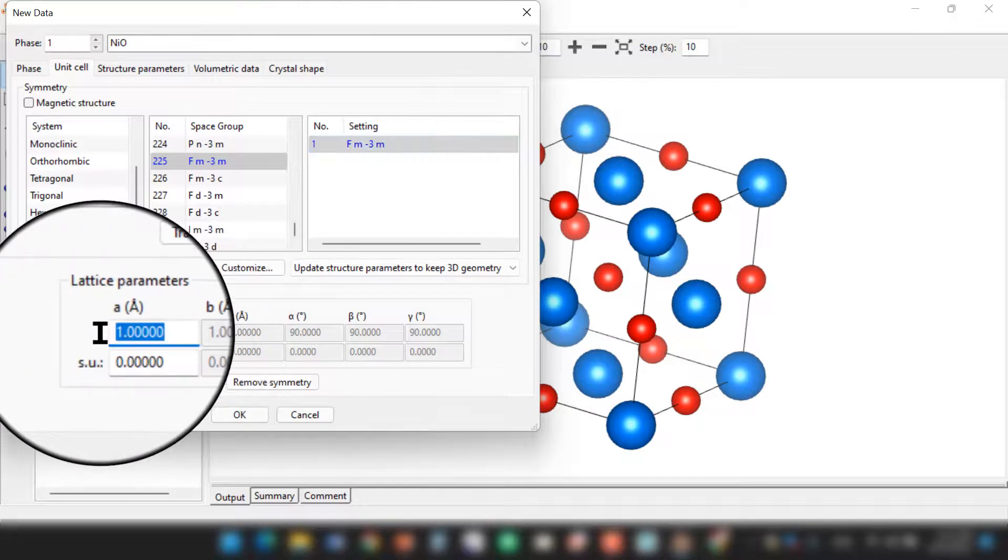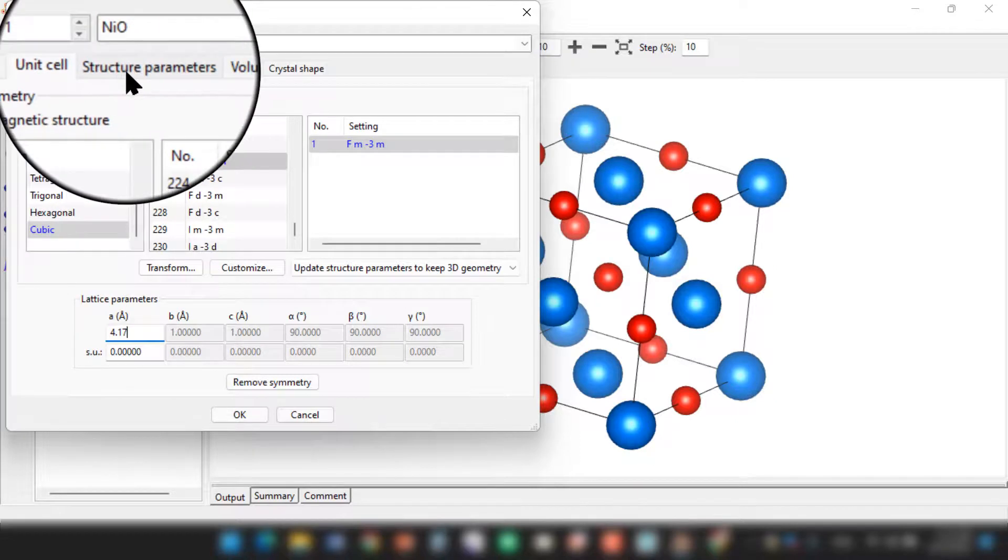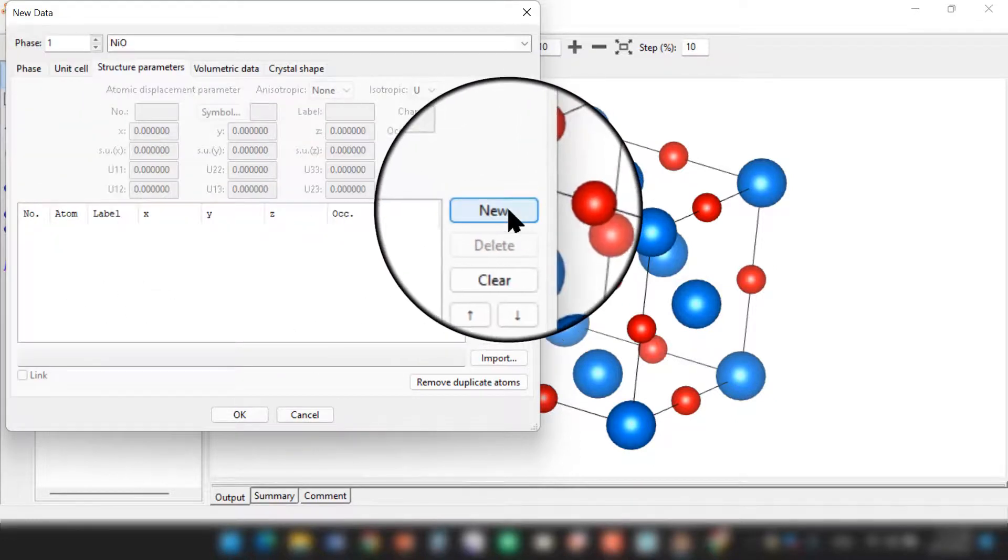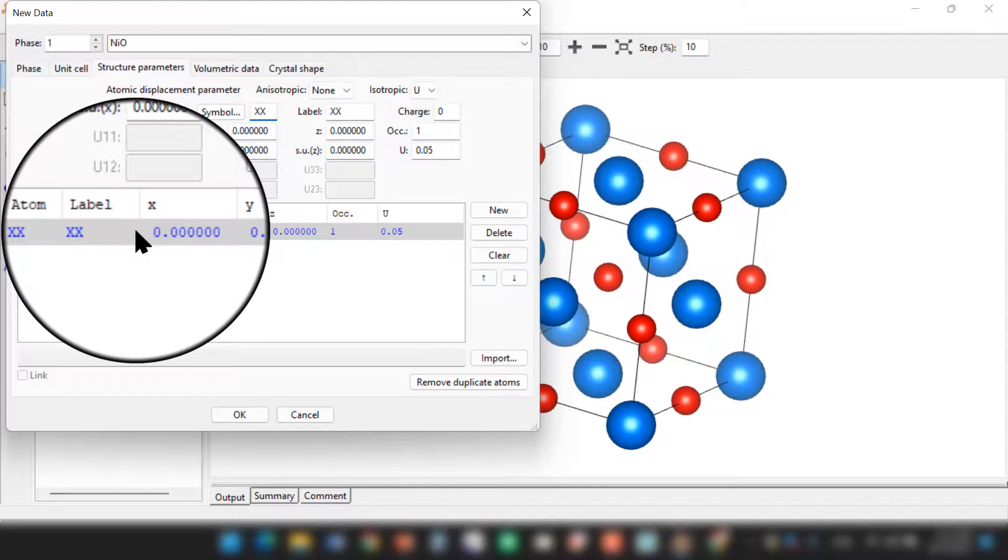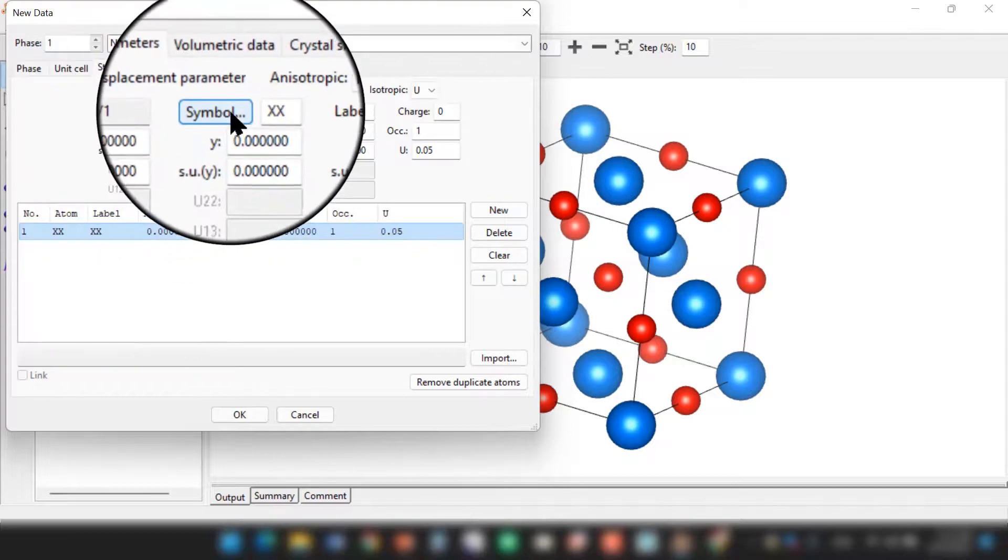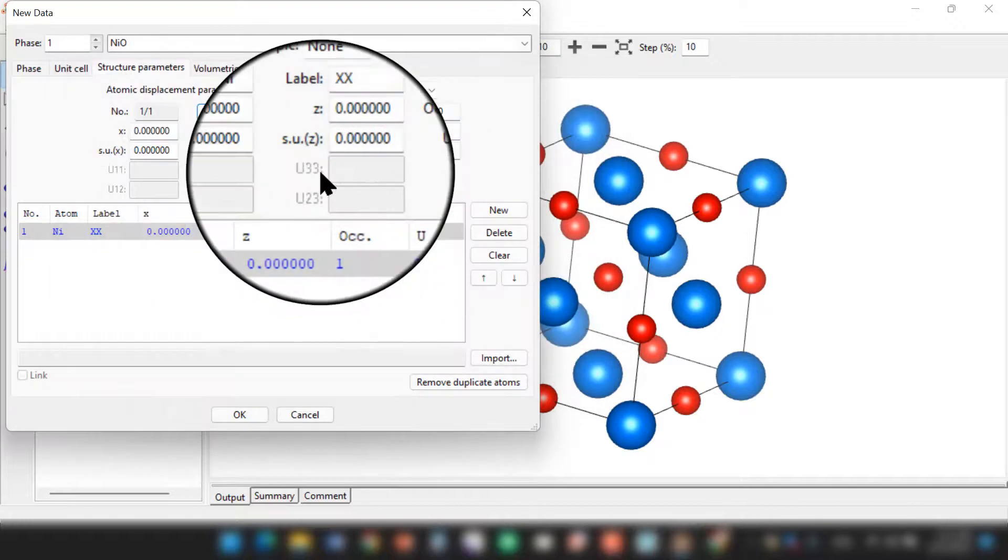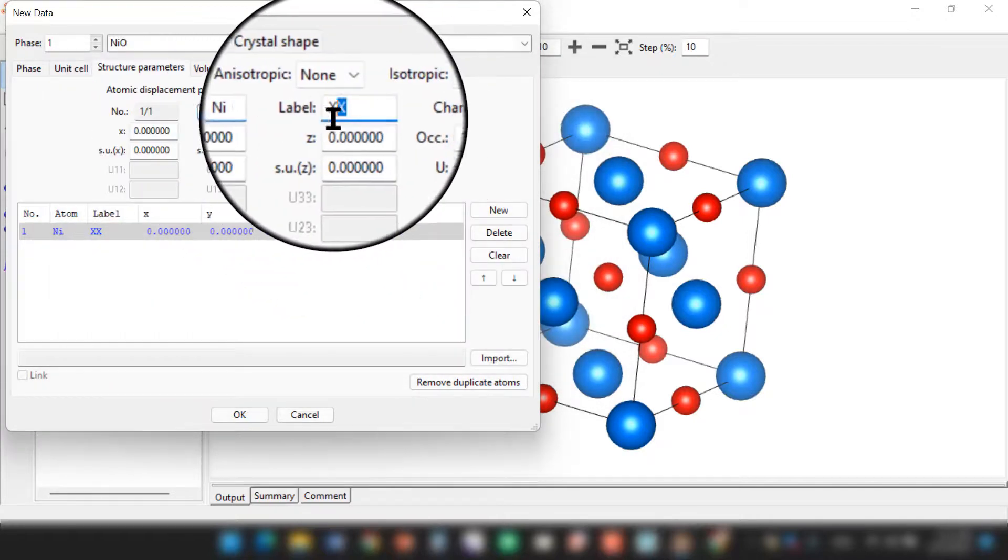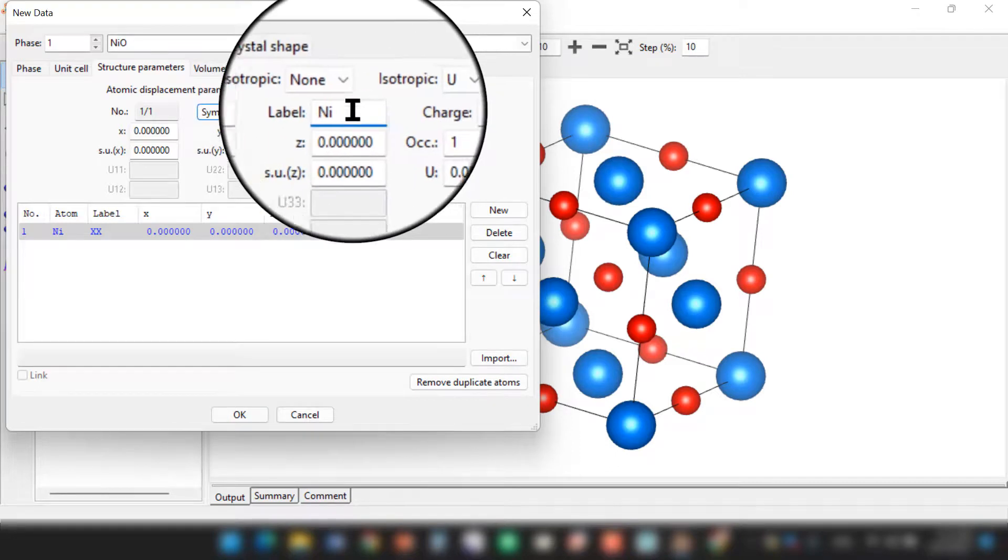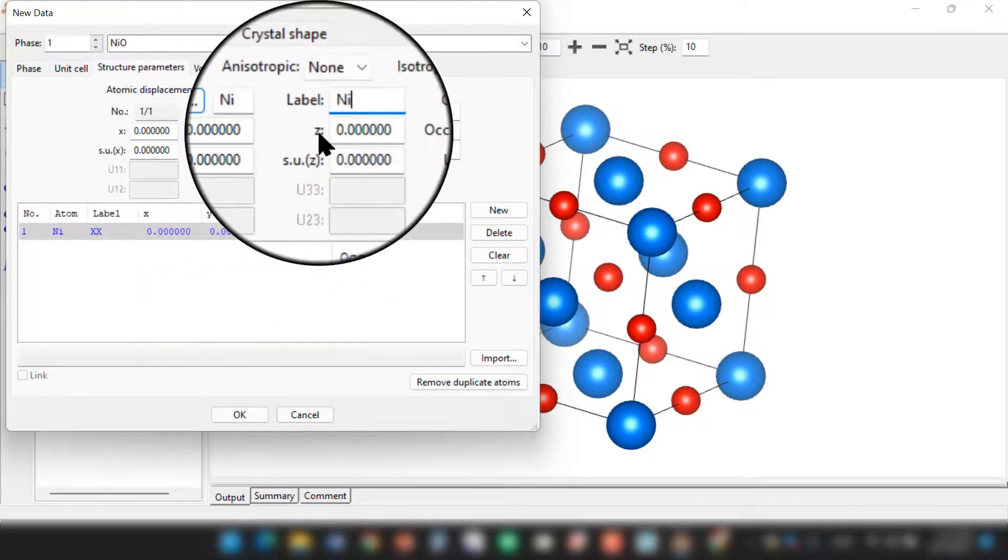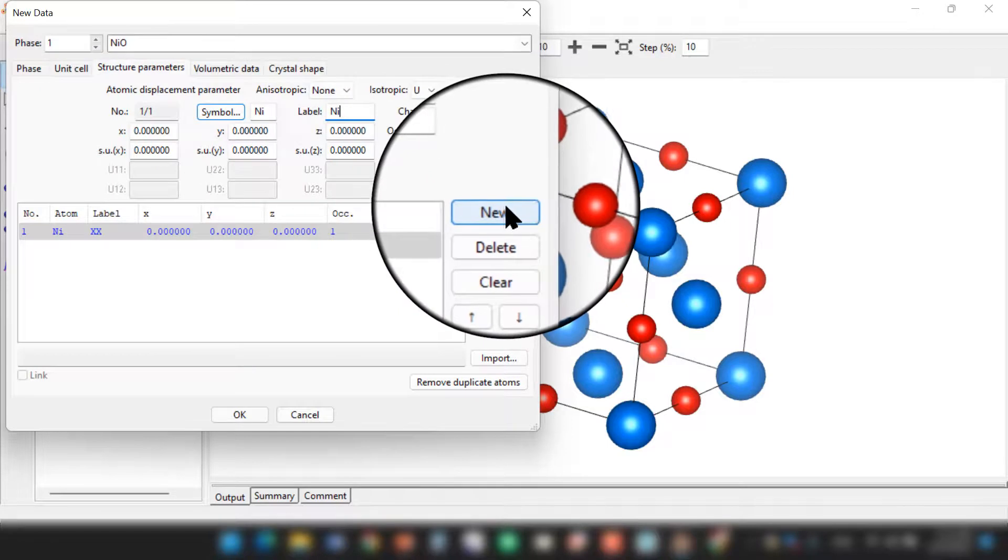Now go to the next step, Structure Parameter. Click on New. Here we need to choose the element. In this case we have nickel. Label it as nickel - you can label anything you want. Then XYZ is 0. Then again click on New.